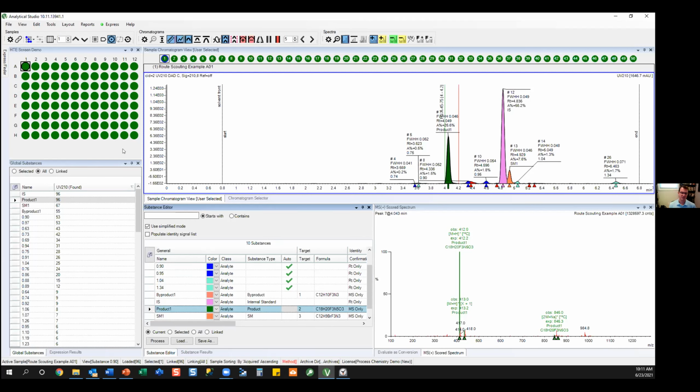Of course, we as scientists understand that high throughput experimentation and reaction monitoring is not necessarily a simple thing. There are many different types of approaches to these experiments. For example, you may have a different reaction in every vessel or in every well of a plate with a different desired product in each case, or you may be after the same product in all wells, but just vary some sort of reaction condition across the plate or across different vessels. For example, different solvents, temperatures, pressures, concentrations, et cetera.